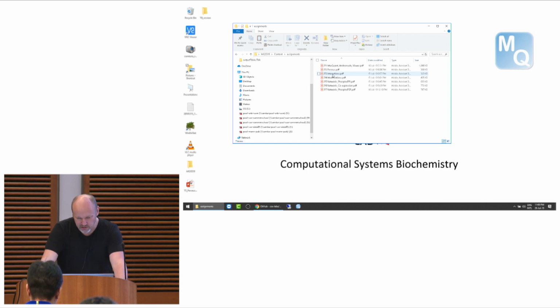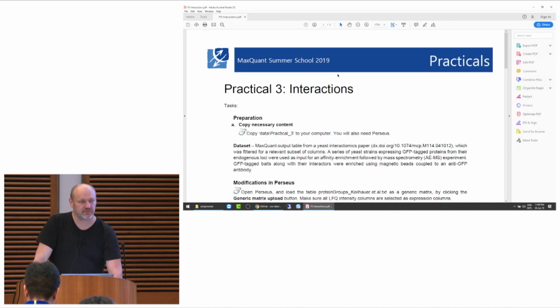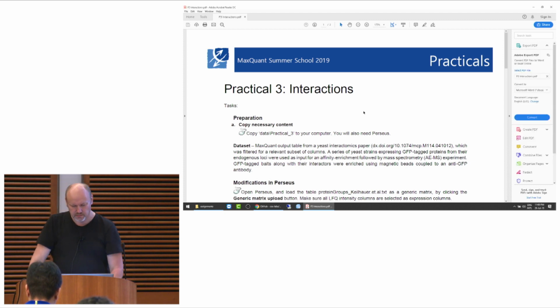Yeah, hello. So I will indeed walk you through the interaction proteomics exercise. That's the P3 interactions PDF document in the assignment folder. We're going to work on a pull-down data set. The publication is given here, which was a bit downsized from what is actually done in the publication, so that it's a bit more handleable in the session here.